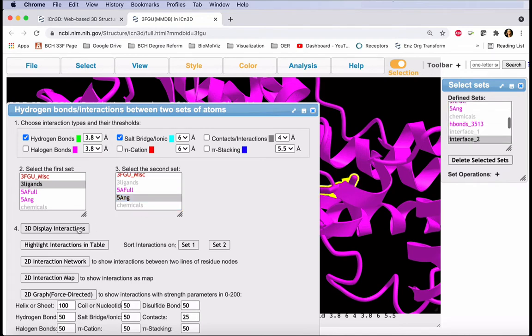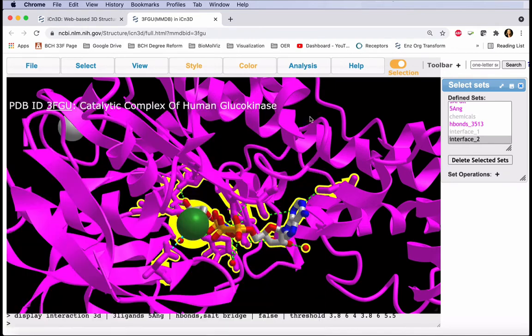Click on 3D Display Interactions, and close the window. Notice we see now pink sticks for the interacting residues.